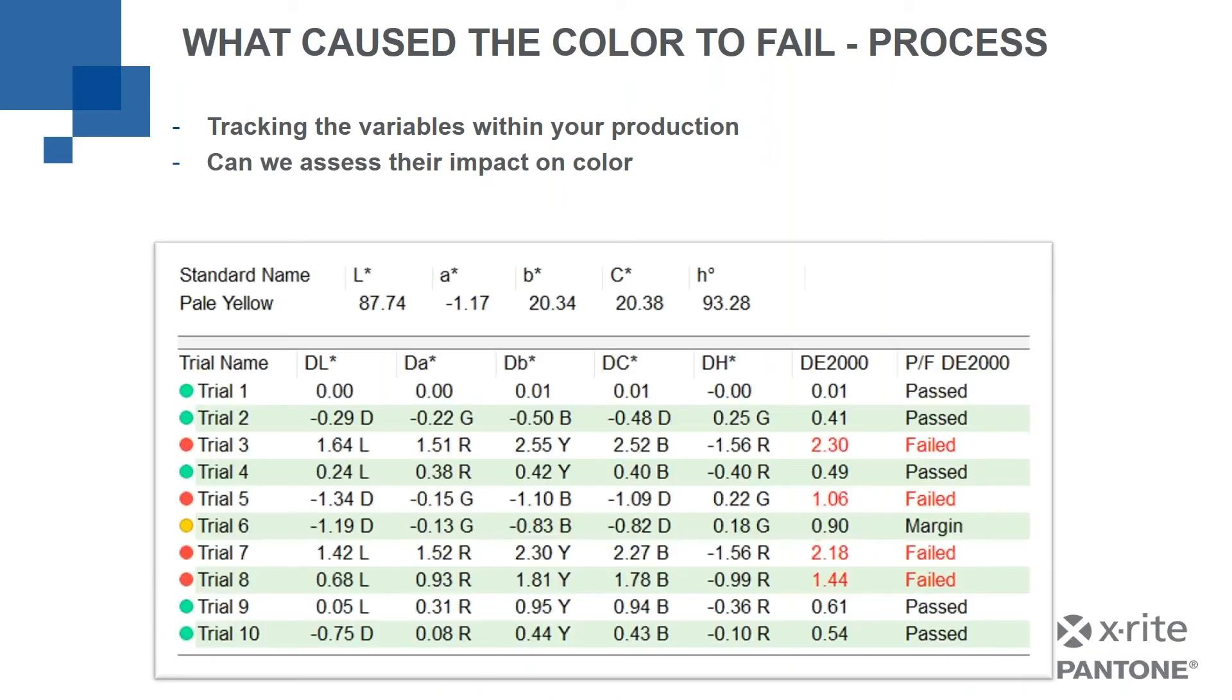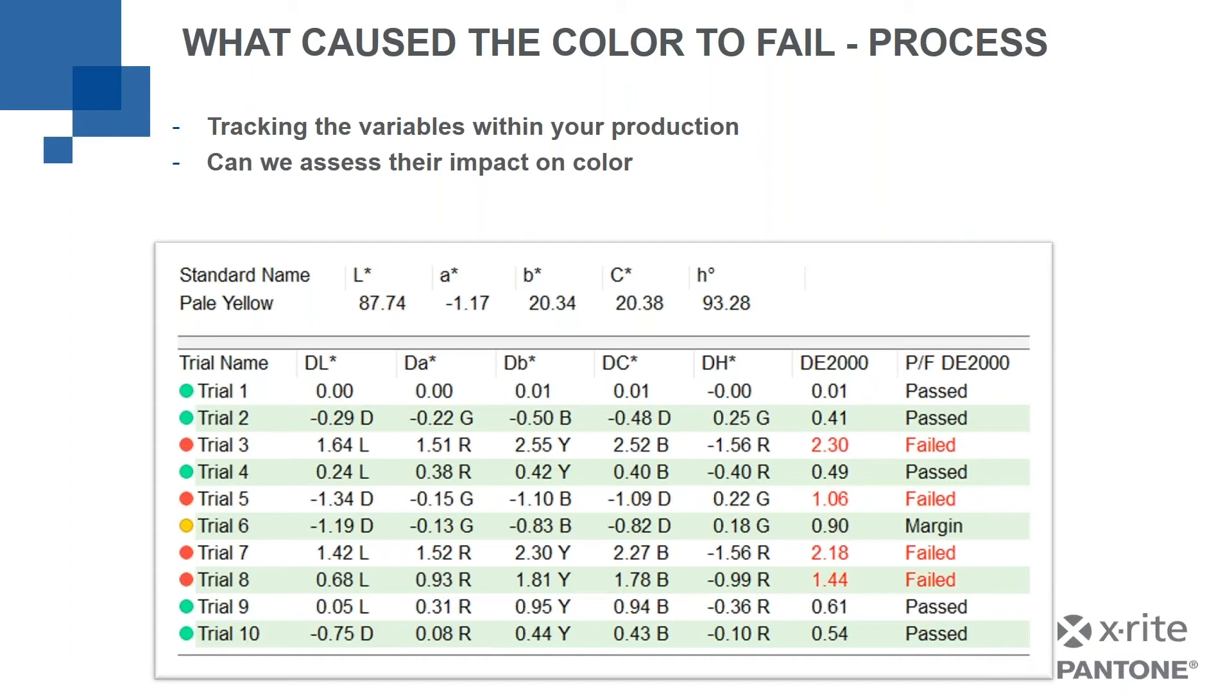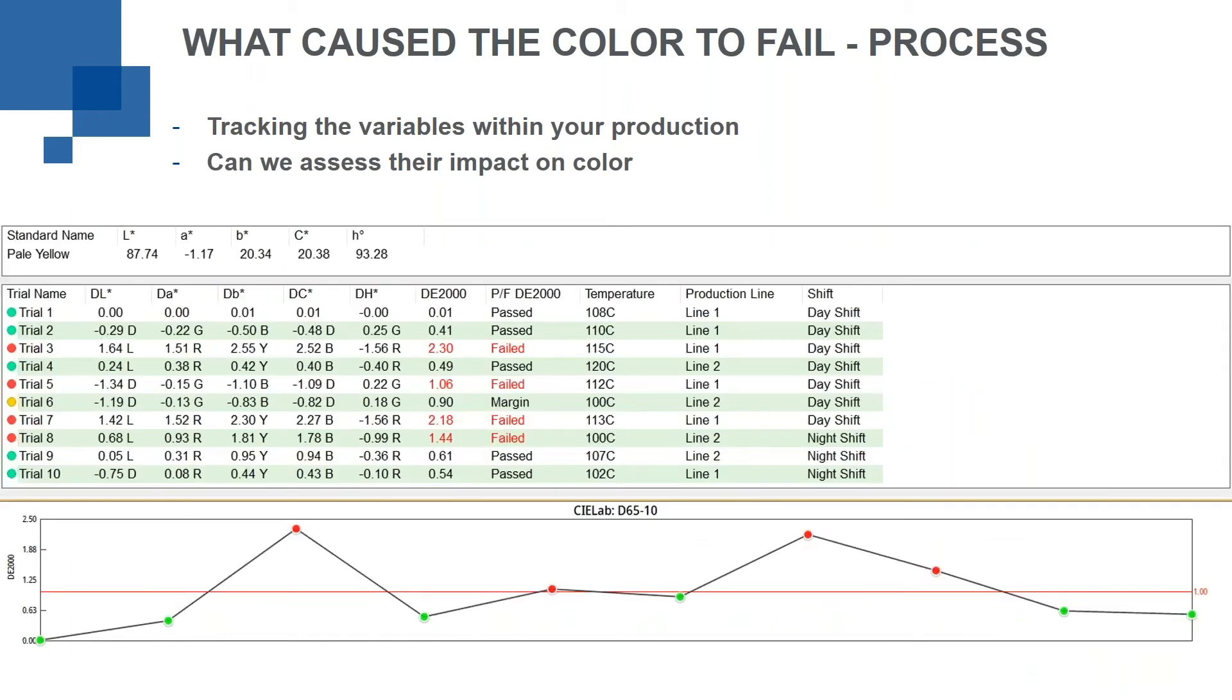So again, here we are back to our pale yellow, pale yellow standard with multiple samples. We've got some fails, we've got some passes, and we've got one in the margin. So what's the real problem here? So let's take a different look at this exact same data. So in this view, what we get at the bottom is you'll see a trend chart where it's plotting the tolerance, the delta E 2000 in this case, the green dots pass and the red dots fail.